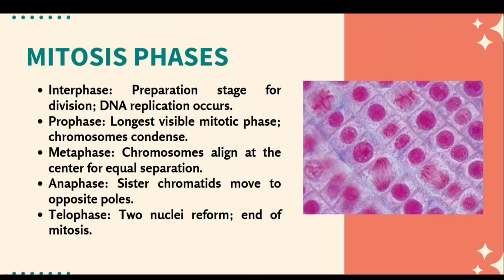The last phase is telophase, where the nuclear membrane reforms and the cell prepares to divide. These stages can be observed clearly using appropriate staining.